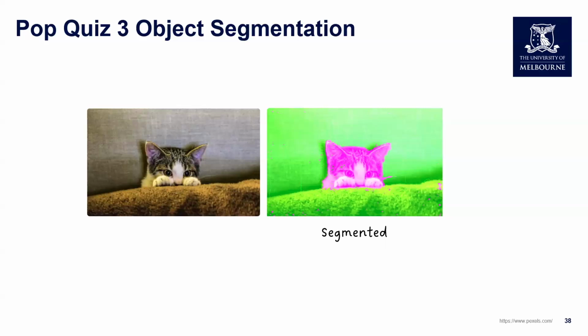It's best to calculate it logically. The third option was to apply a different auto threshold algorithm for each image. Again, this is not really considered an objective option. So the best way is to find the algorithm that works on your entire data set and use that auto threshold method.